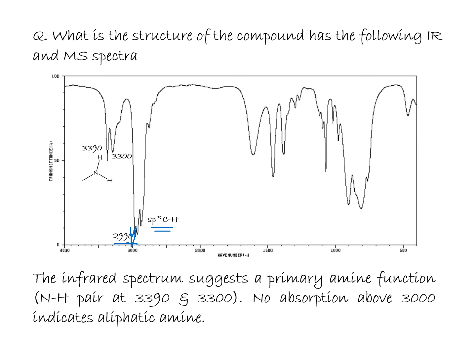You have again two peaks for NH2. Looking for the carbonyl in this area, no carbonyl, so your compound is most likely an aliphatic amine.